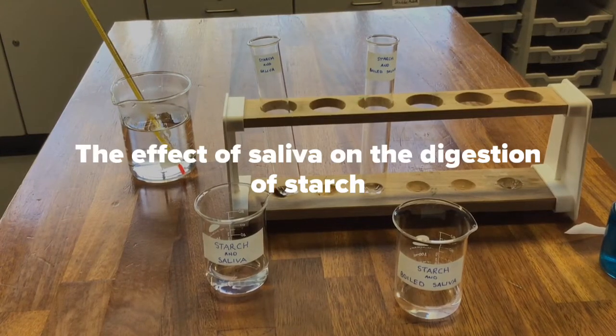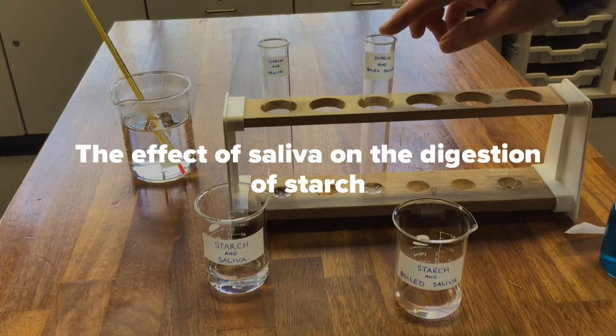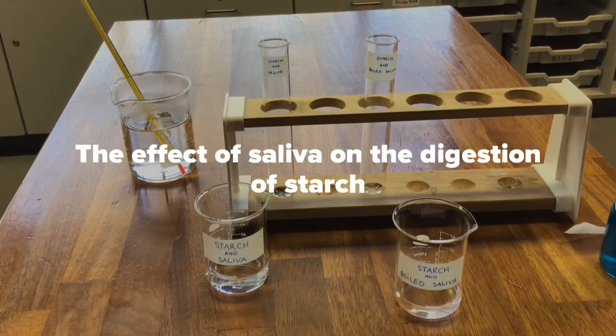The effect of saliva on starch. So saliva is produced in our mouth by our salivary glands and contains an enzyme that will break down starch to sugar. In this experiment, we are setting up two test tubes, test tube A that will contain starch and saliva, and test tube B that will contain starch and boiled saliva.